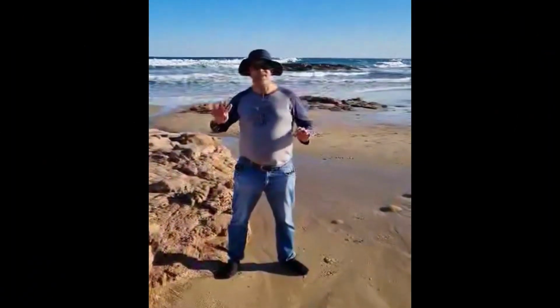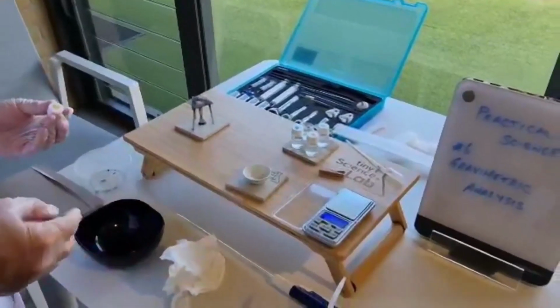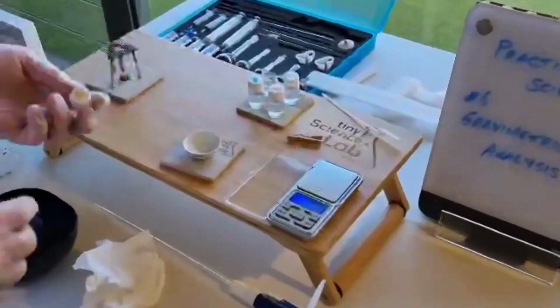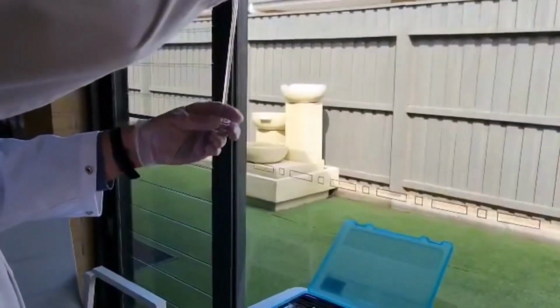And now here we are, beach number 4. This is Birubi Beach. So this is our yellow beach. Gonna take a sample. 3 down, 1 to go. Our final beach is our yellow beach, and that's Birubi. So let's again weigh it empty. So 10.84. And now let's grab ourselves some of the Birubi sample.